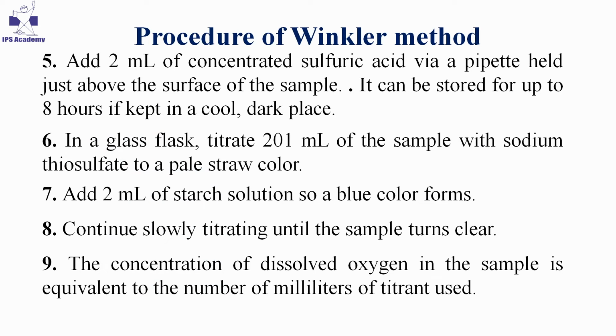Now take 201 ml of reaction mixture from the BOD bottle to a glass flask and titrate by adding hypo solution till the reaction mixture turns pale straw color. Now add starch indicator.